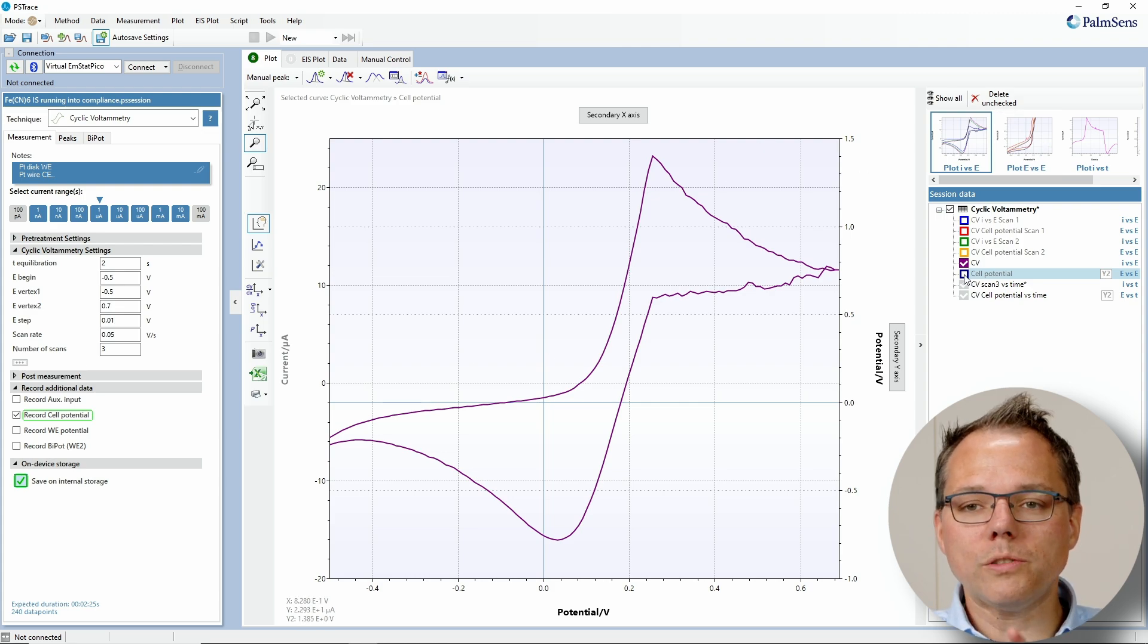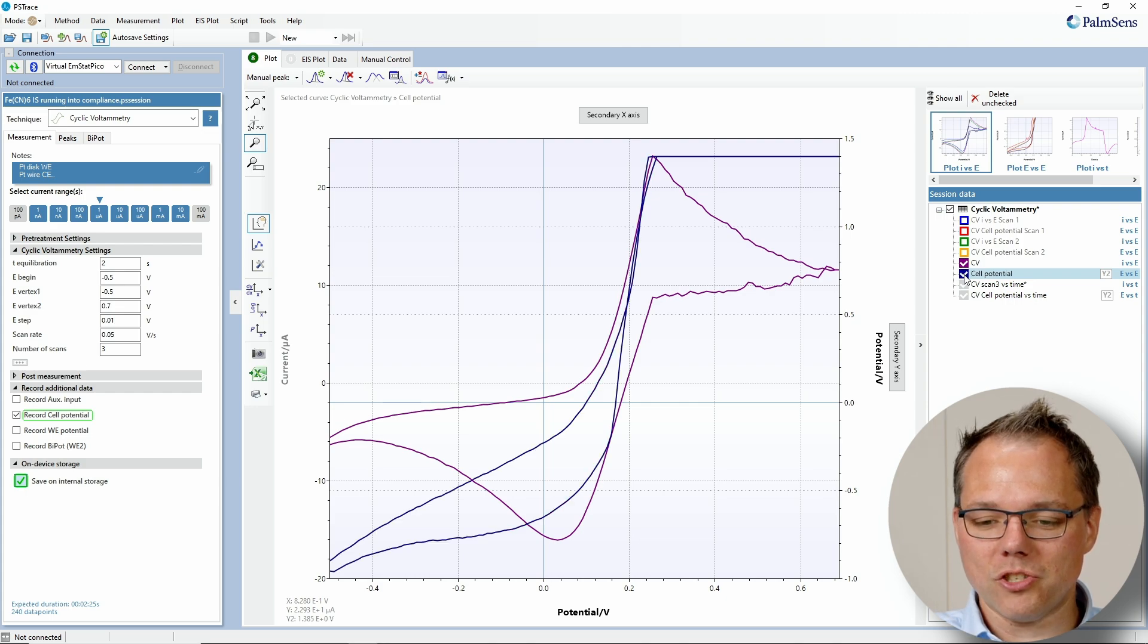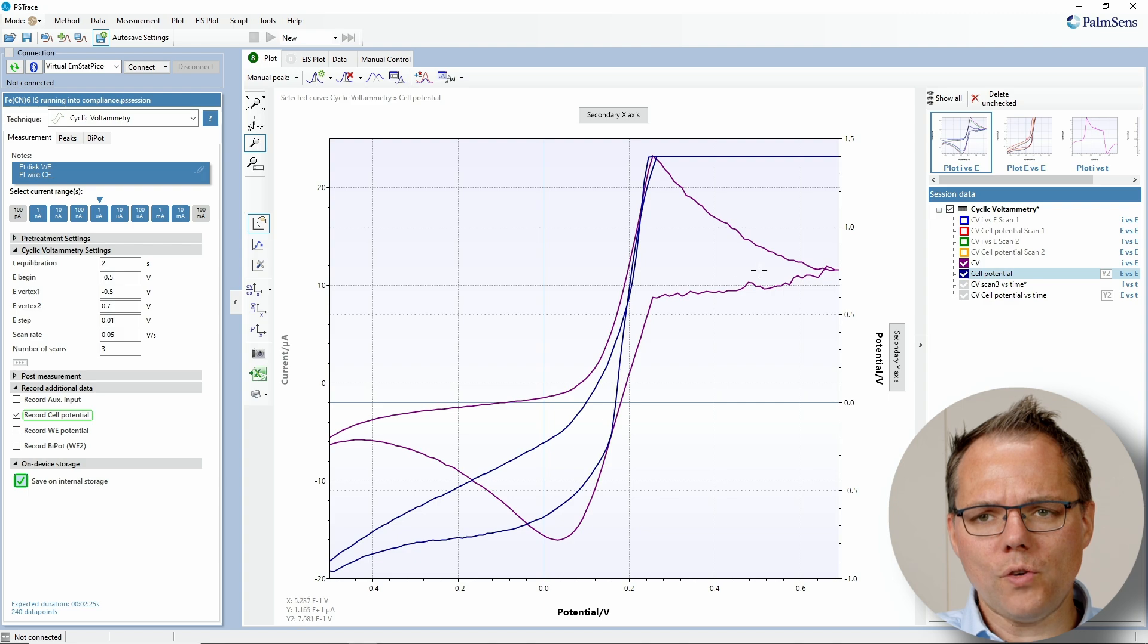So when I now also put in the same graph the cell potential, you see that at the same point where I have this very sharp peak, I get suddenly a flat line. I've reached the maximum cell potential that I can apply. Why does now the curve look this way?